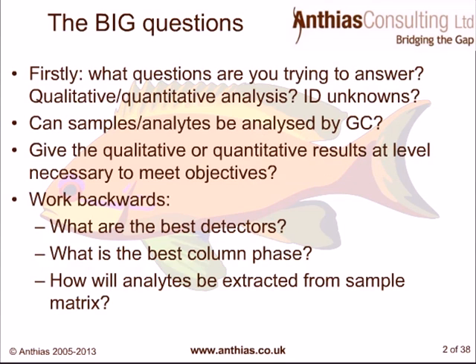The first questions when thinking about developing a method are the big questions. So what questions are you trying to answer? Well, as an applications chemist, many times people would bring me a sample and they wouldn't quite know what they wanted to get out of it. So what questions are you trying to answer about your samples? Do you want to do qualitative or quantitative analysis?